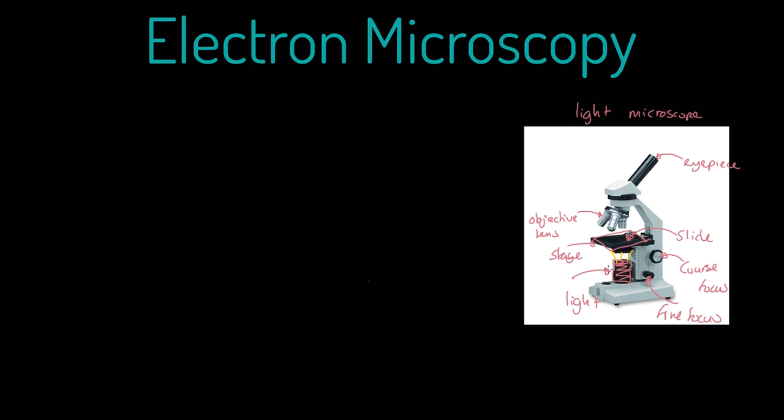I don't think there's going to be any particular surprise there, but we have a problem, and the problem is that there are numerous, and perhaps for really deep microscopic science, 2 significant weaknesses of light microscopes. So let's actually see what those weaknesses are.